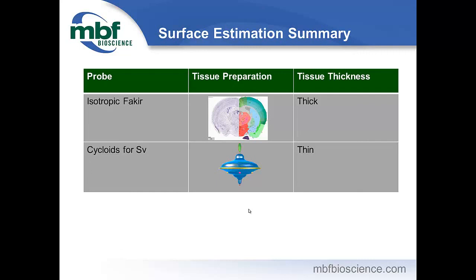It doesn't take any time really to actually estimate the volume of your region, and so we recommend using a probe like Spaceballs or the optical fractionator to get your number or length without calculating a density, if you actually do need a density, so think about that question too.